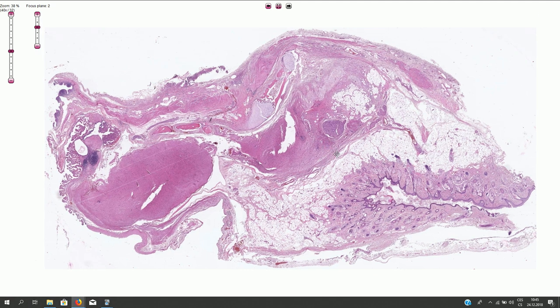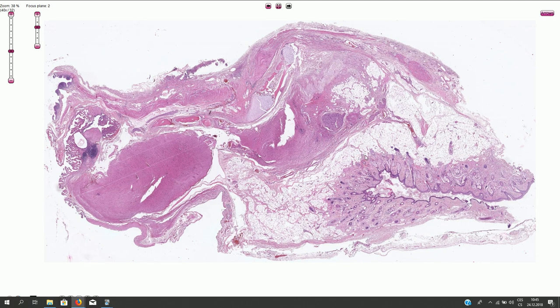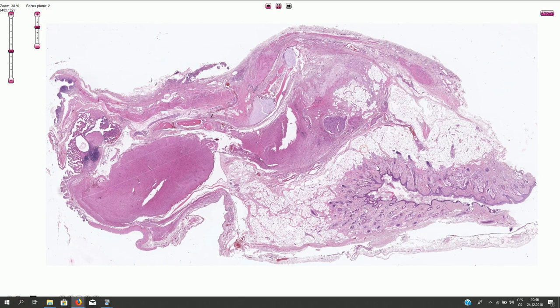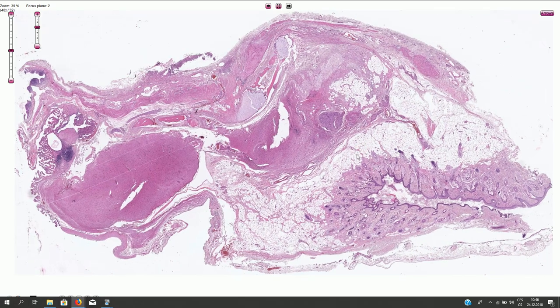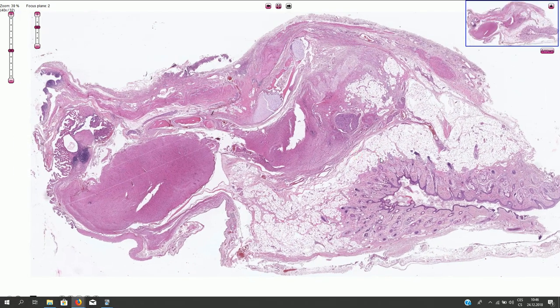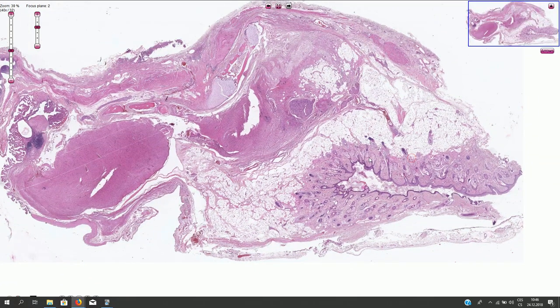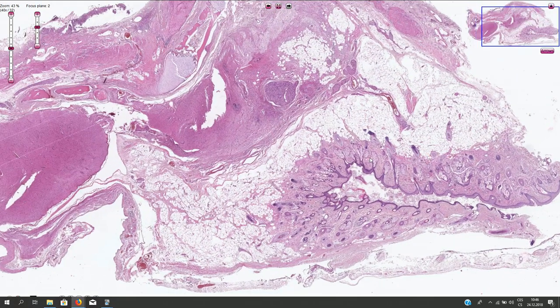Microscopically, and sometimes also grossly, we can see all sorts of different tissue types. Practically anything can happen in this tumor, and it is kind of a good histological exercise. So let's have a look if we can recognize what we see here.